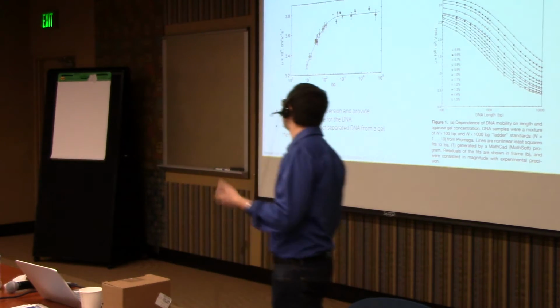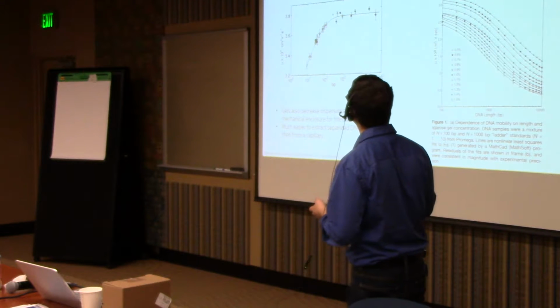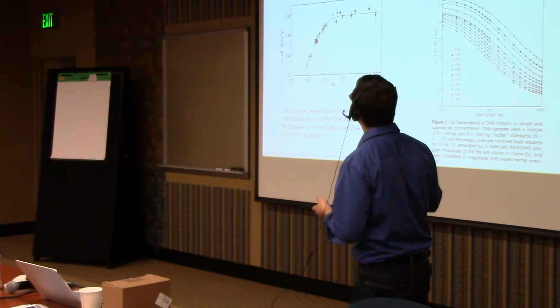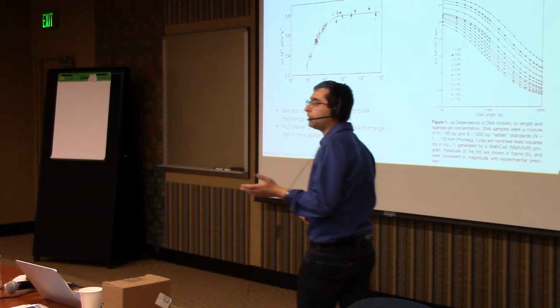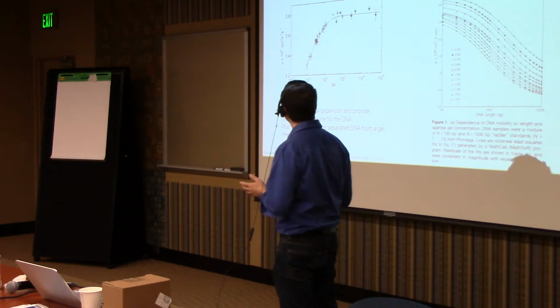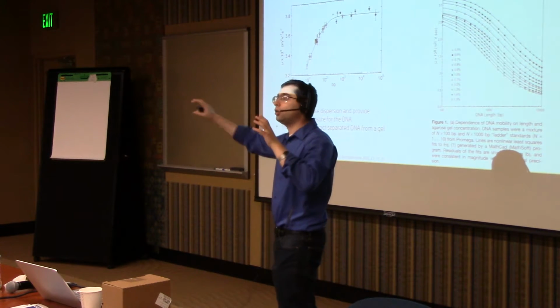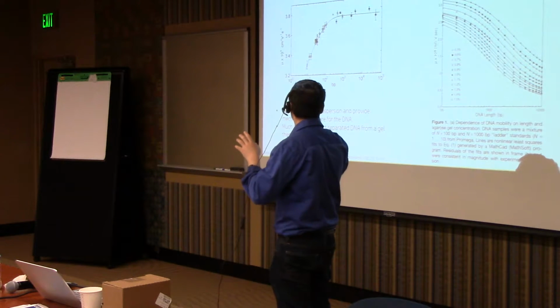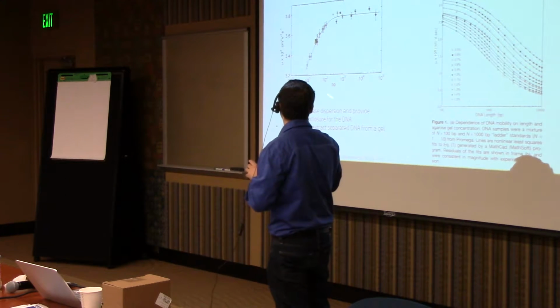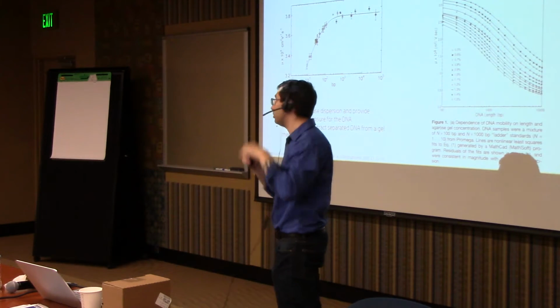And so in real practice, the most common electrophoresis application is to figure out the DNA mobility. Okay? Turns out, if you have DNA, it's a long chain of monomers, and a base pair corresponds to a pair of monomers if it's double-stranded.